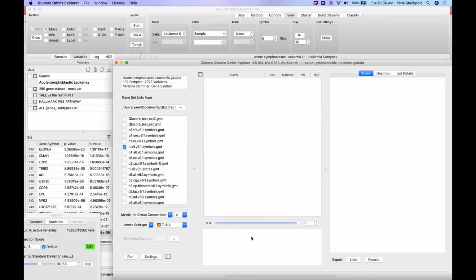And while we're doing this, another question: how to mark and color label variables on the heat map. Yes, there are many choices, and I will show that quickly after this. You can pick your label, you can change the label size, you can color them in different ways, and you can also mark, if you would like sometimes to highlight a gene list or one gene.